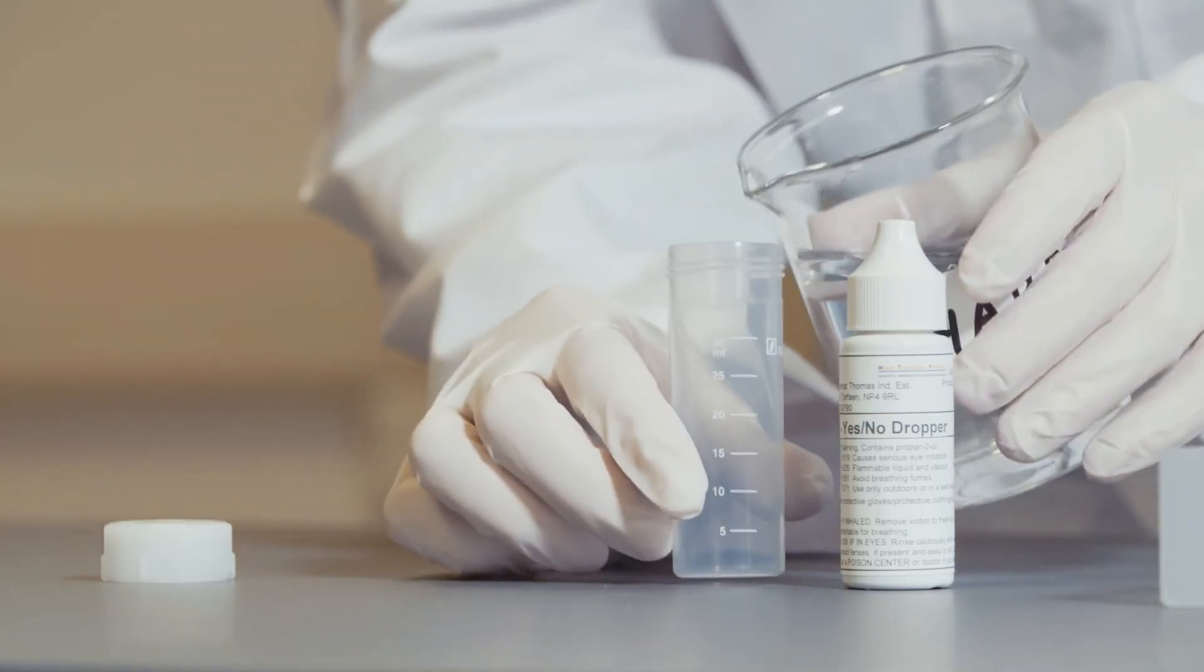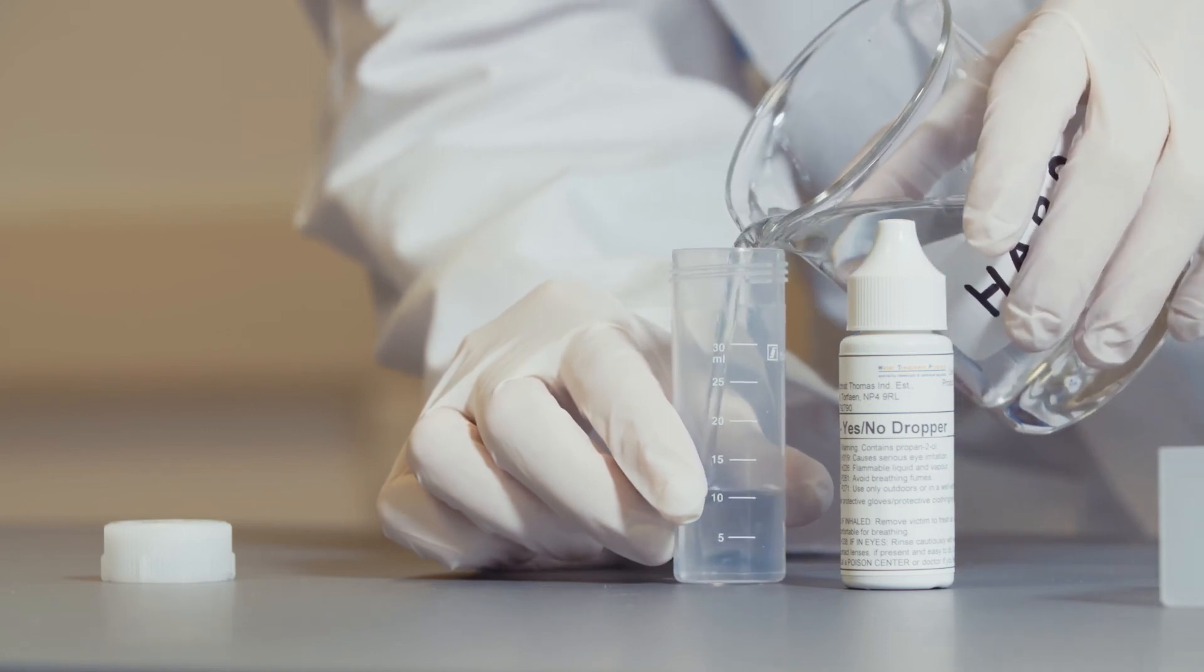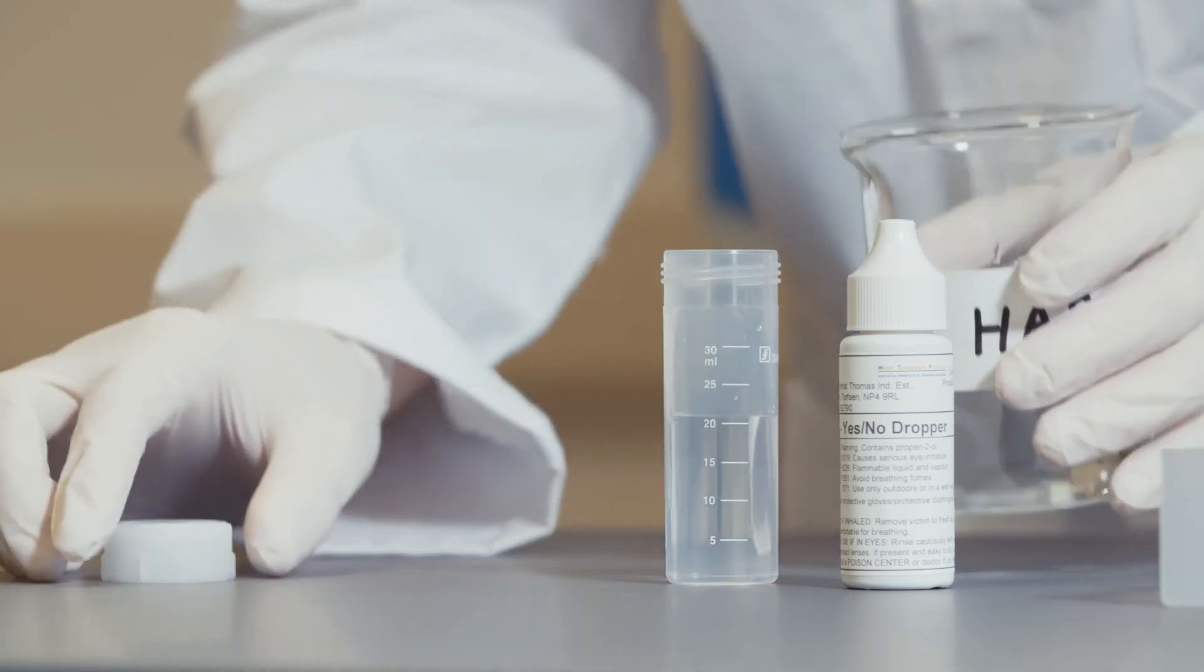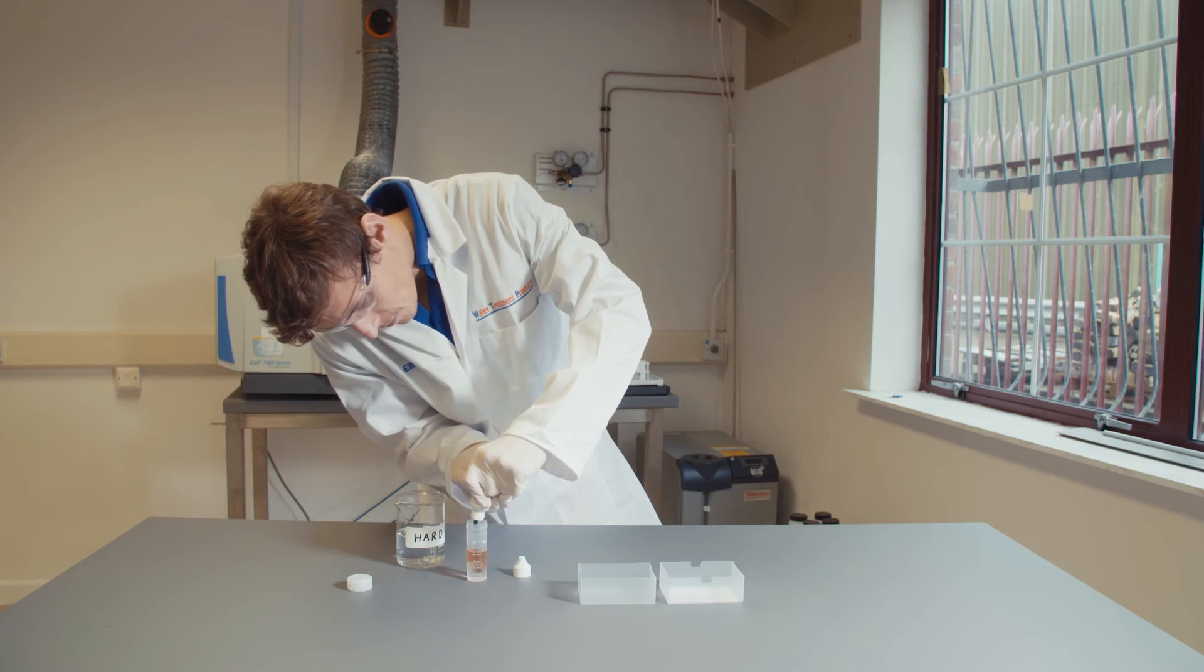The same procedure is followed. Fill the sample pot to 20 milliliters and add five drops of yes no hardness indicator.